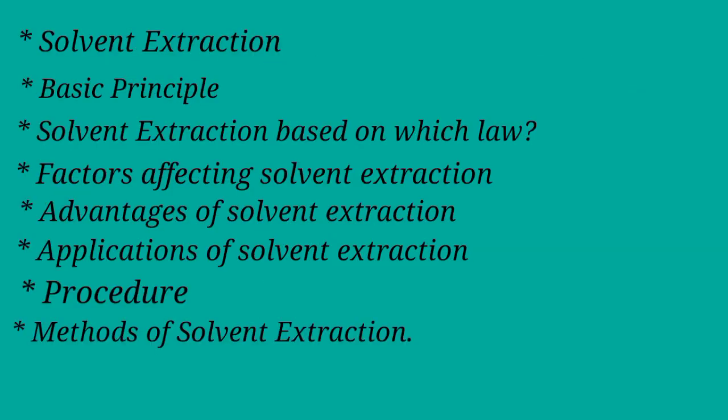Discussion topic is solvent extraction. Separation of components of a mixture is essential in our daily life. For this purpose, different separation techniques are used, such as chromatography, evaporation, crystallization, distillation, and solvent extraction, etc. These are used based upon the nature of the mixture being separated. Here we will discuss solvent extraction.